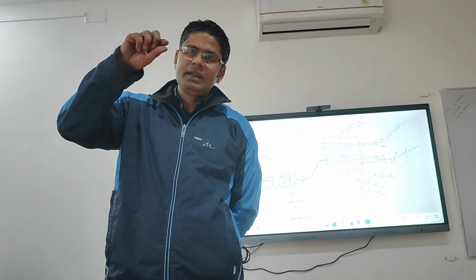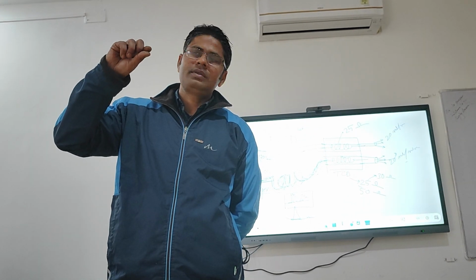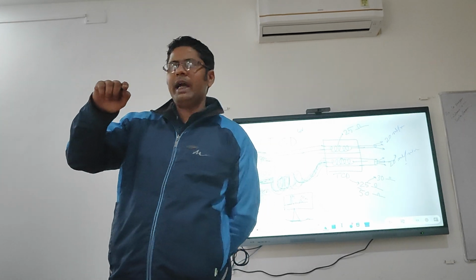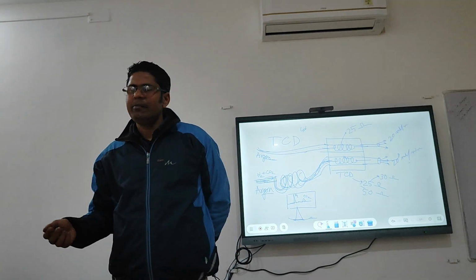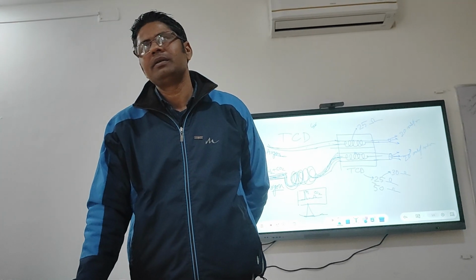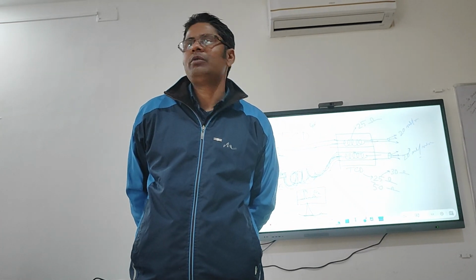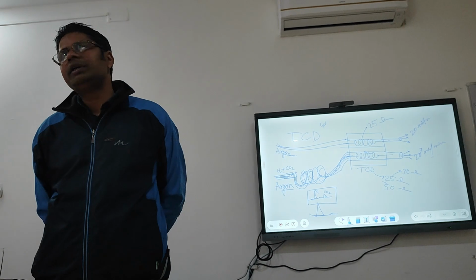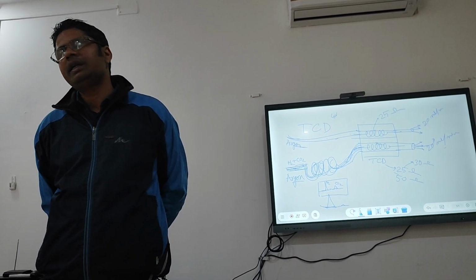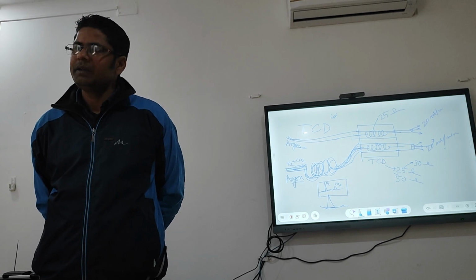So at the TCD detector outlet, all the samples will be unchanged. So the TCD detector outlet can be taken and given to the FID detector. Some components will be detected in TCD and some hydrocarbons will be detected in FID. So we will get some peaks in TCD and some peaks in FID.